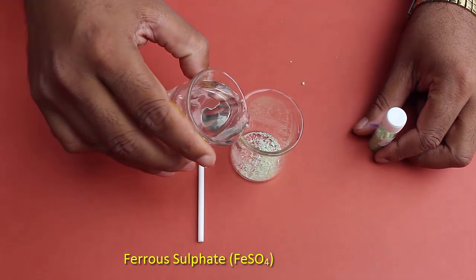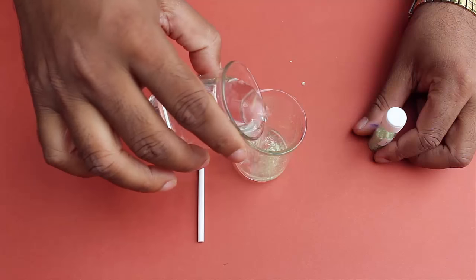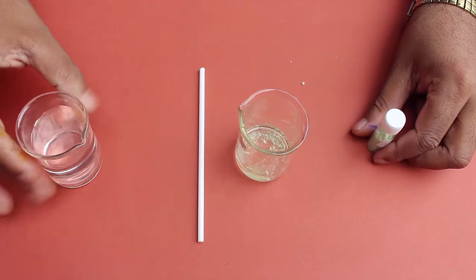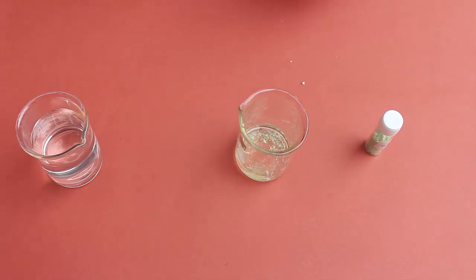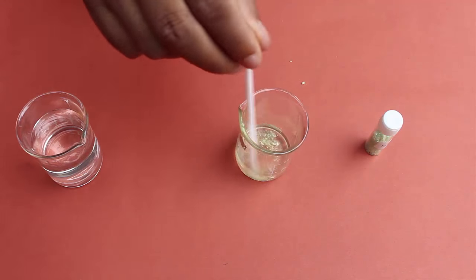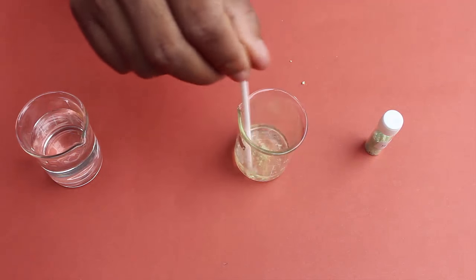And with the stirrer we have to stir it such that we can get a very clean solution of ferrous sulphate.